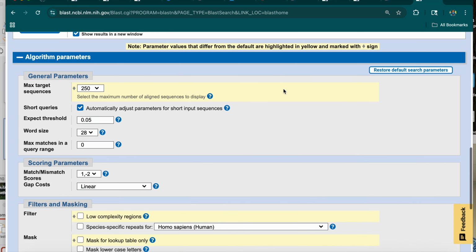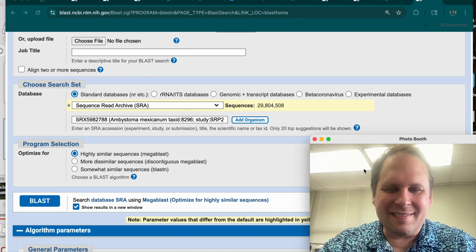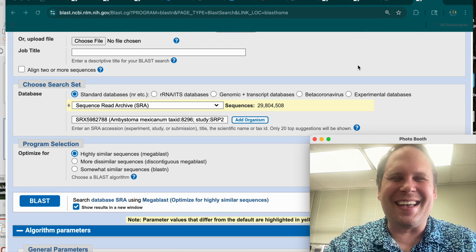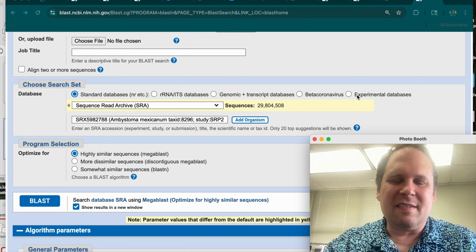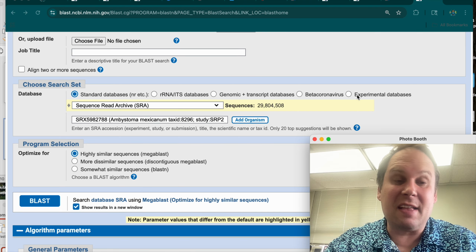Like, I'll sometimes forget to change that to SRA and paste in the thing, and whatever. It's dumb mistakes. I have made those dumb mistakes. Don't think I haven't. I make them all the time still, and it's okay. It's just a little blip. 5 seconds, you notice what you did, and you're like, okay, fine, whatever, and you fix it and you move on.